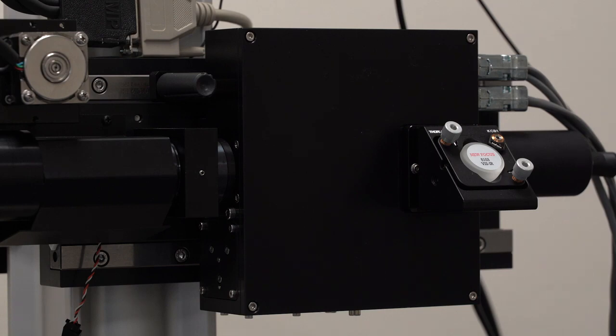We wanted to stay away from a lens-based relay system because we were worried that the additional glass of the relay lenses would increase pulse dispersion of the excitation beam. Ultimately, we used a design from an earlier Sutter project, the DG4. The DG4 uses parabolic mirrors to relay one Galvo focus onto the other. With a mirror-based relay system, we no longer need to worry about additional pulse dispersion in the excitation beam. And it turns out this also allows us to keep the total scan box design smaller than in other RGG systems.